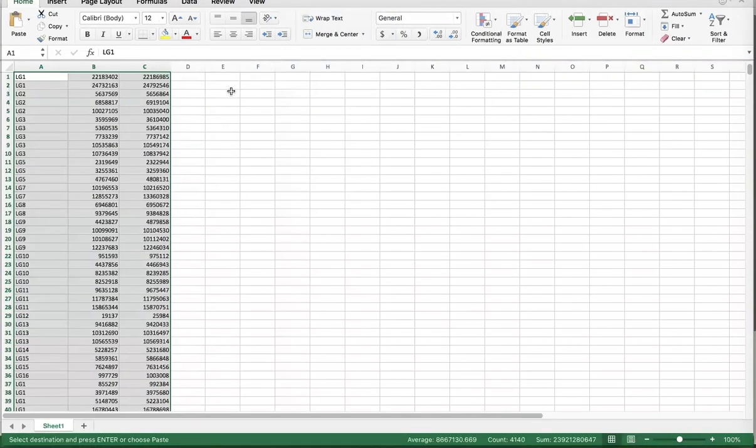The coordinates are in the format of chromosome ID, start, and end. There are actually a few different formats that it accepts, but it has to have these three pieces of information. The most common format would be tab delimited. And it allows you to just paste in, if you have these columns in a spreadsheet, you can just paste them.